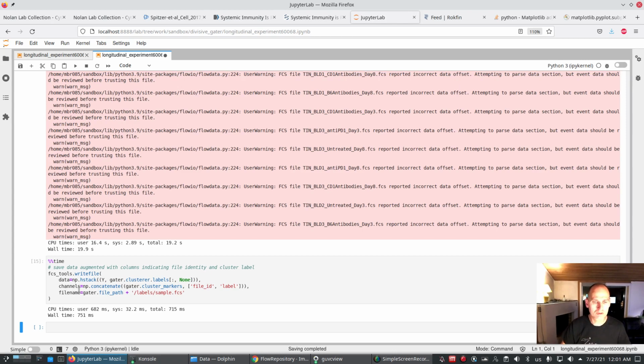So this was the first step in doing a longitudinal study. So I'm going to stop this video here, and then I will come back immediately in a new video where I use the cluster assignment that I made here for a sample to extract clusters for all files.